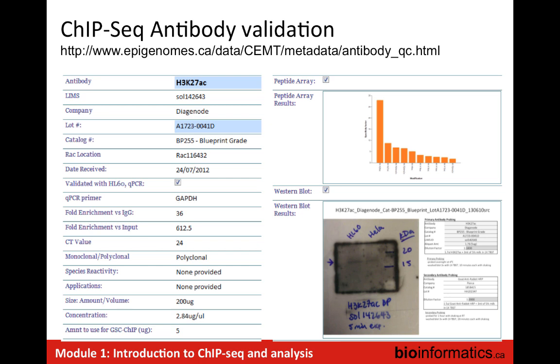And do you see a lot of variation from lot to lot? Yes. Even with the same catalog number, different lot, which you'd think would be the same bleed if it's a polyclonal, but we see different affinities, suggesting that it's actually not the same bleed. And, you know, there are these so-called ChIP-seq gold standard antibodies. My experience has been that it's an unsolved problem in the literature.